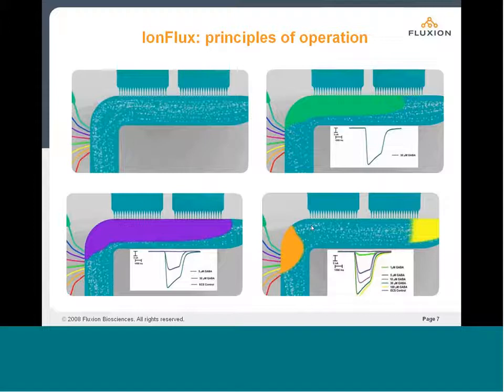And so very fast solution exchanges can't be achieved, because a certain amount of time has to be allocated to the physical process of picking up the compound and delivering it over into the next one. And that's one of the advantages of the microfluidic approach, as well as, of course, reducing the overall costs of the system.